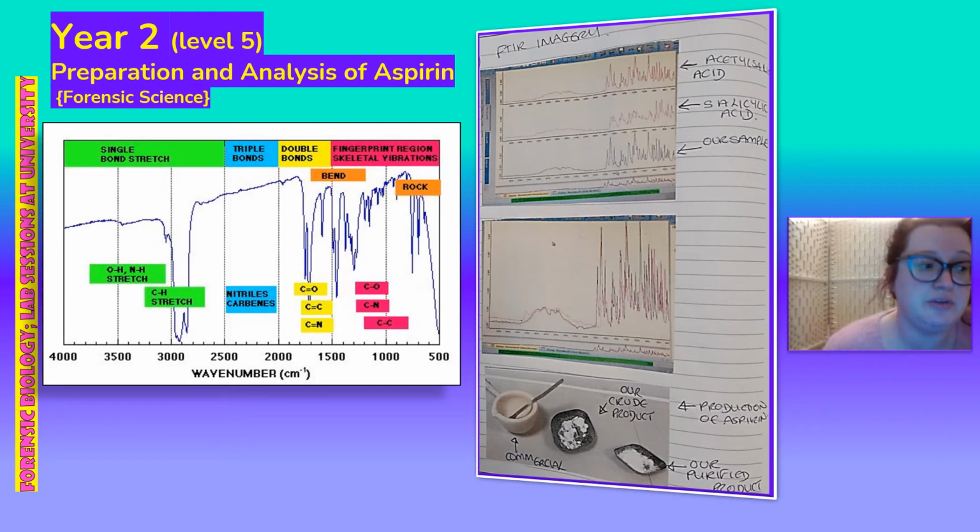For example, you might have a piece of car paint from a crime scene, as I said before, and then they put it in, analyze and work out what materials it is, and then match up to see if it does actually resemble that. It is a key piece of instrument. It can detect drugs. It possibly might be used on border controls and things to detect drugs. I'm not sure. Possibly it could be. Look it up. It'd be quite interesting.